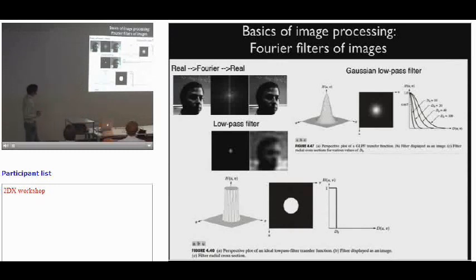So now I told you about a case where we basically just mask out entirely a certain fraction. And this can be described also as a mathematical function. So this is a top hat filter which has a quantity of 1 at these low frequencies and then a quantity of 0 at these higher frequencies.